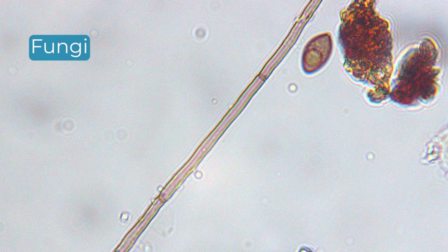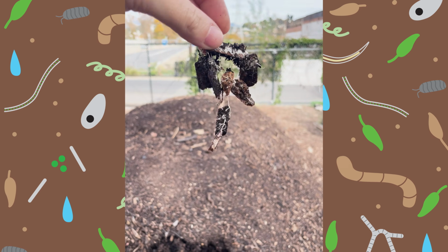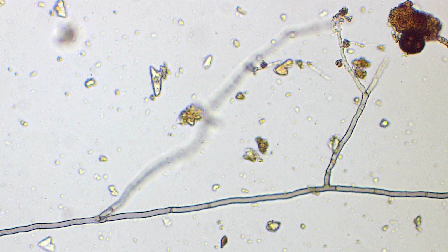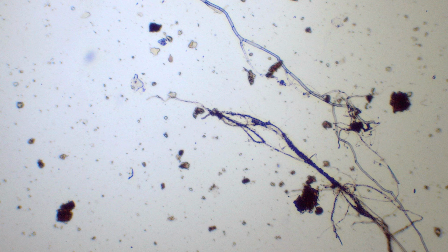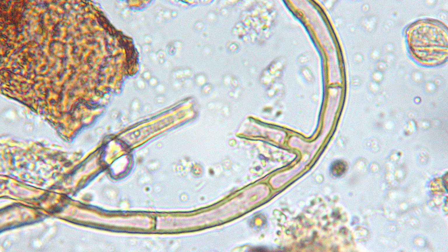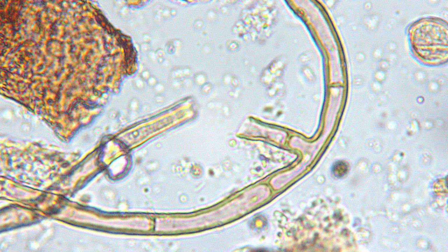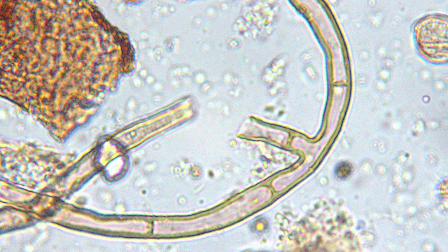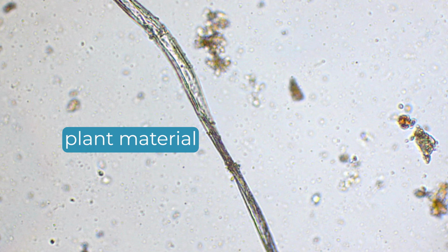Fungi. Fungal networks weave through the soil in web-like structures called mycelium. They specialize in breaking down tough, woody materials and plant cell walls, building strong soil structure and aggregation. Under a microscope, fungi appear as brown or white strands that branch, weave, and connect. They can be identified by their smooth, uniform cell walls, which are different from the irregular, uneven edges seen in plant material.